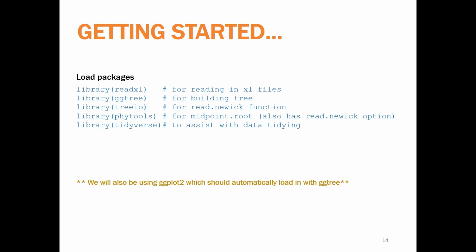And then there's tidyverse, which is really great. It will assist us for tidying up any of the data if need be. And then ggplot2 should be automatically loaded in with ggtree. If you're having any issues, just make sure that ggplot2 is loaded. Does everyone have their packages loaded and ready to go?